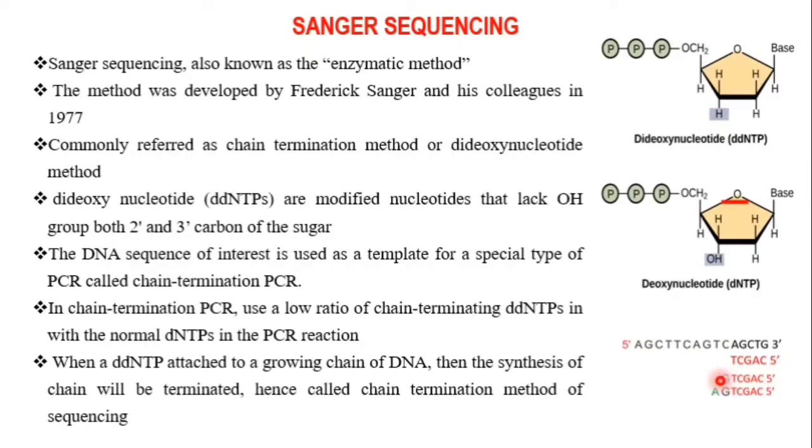So the chain is terminated. That's why it's called chain termination PCR.